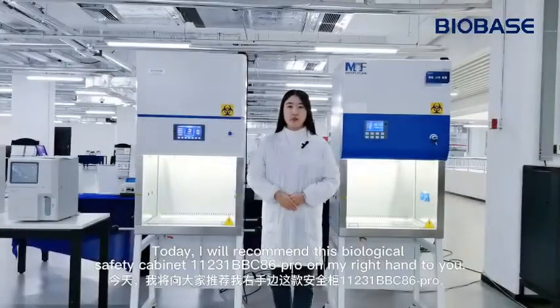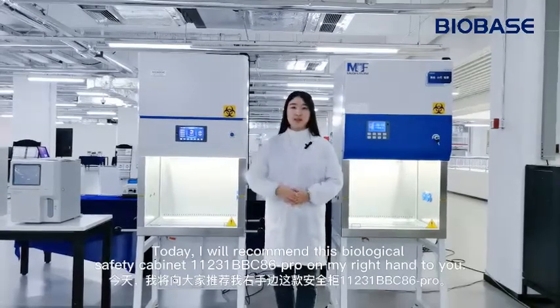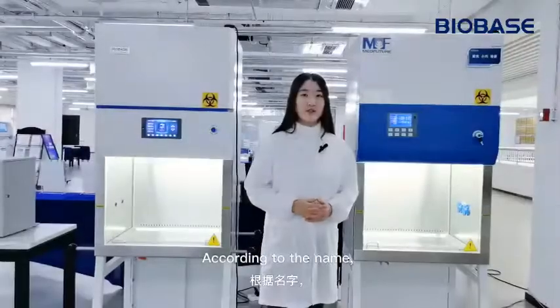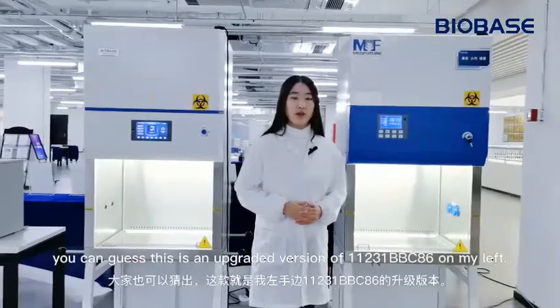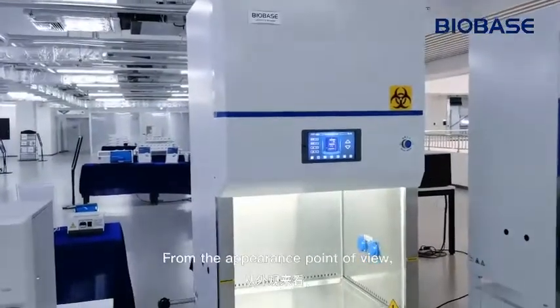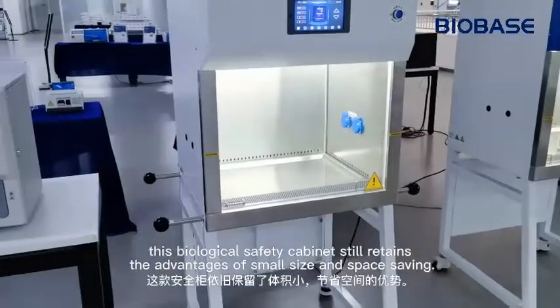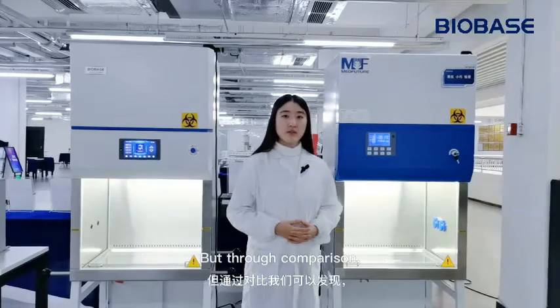Today, I will recommend this biological safety cabinet on my right hand to you. According to the name, you can guess that this is an upgraded version of 11231-BBC86 on my left. From the appearance point of view, this biological safety cabinet still retains the advantages of small size and space saving.